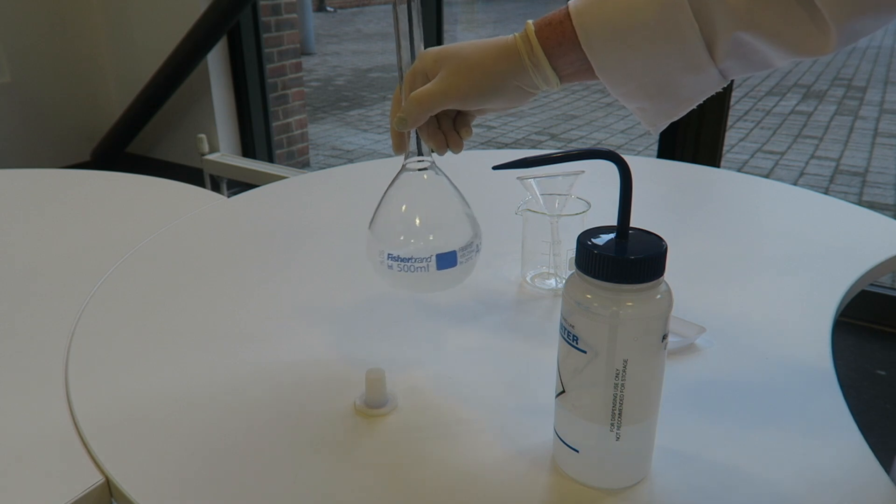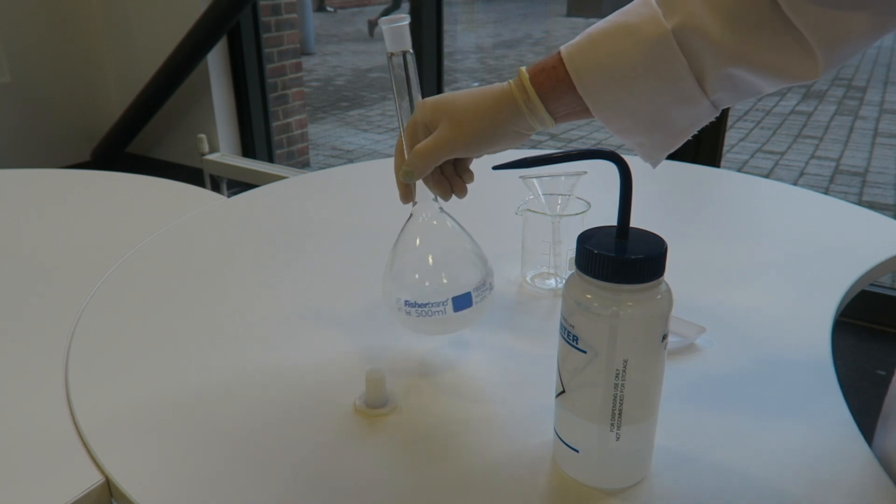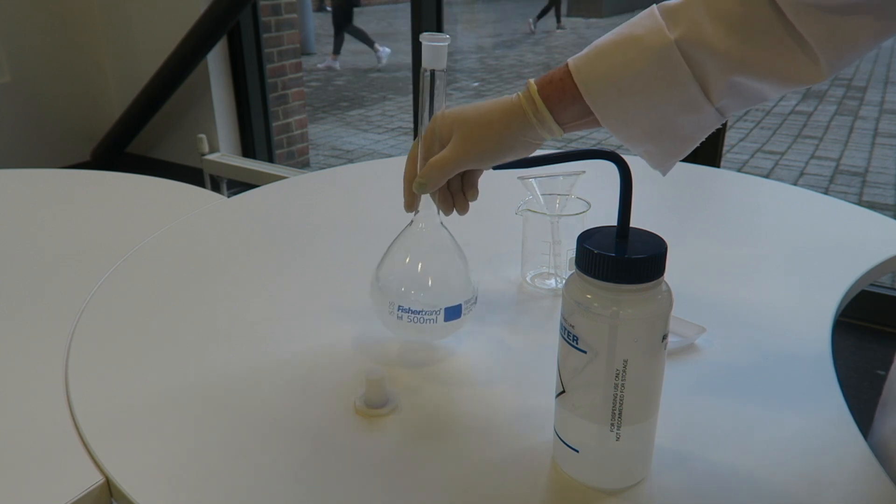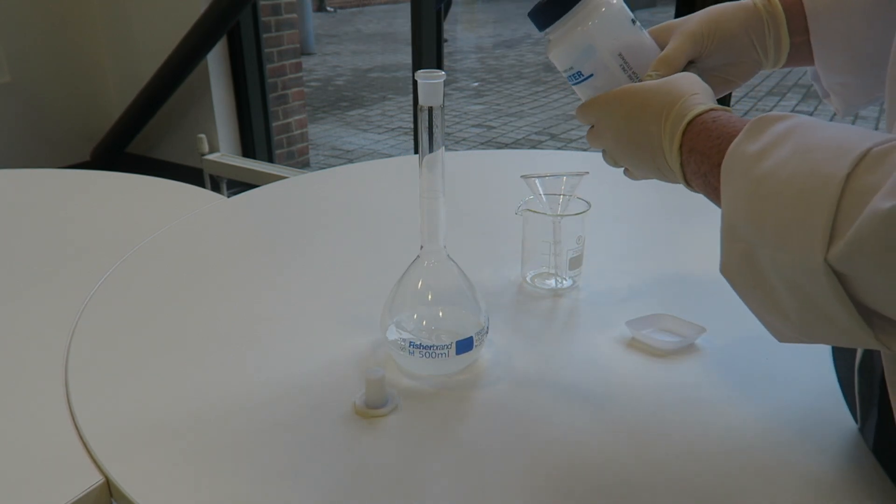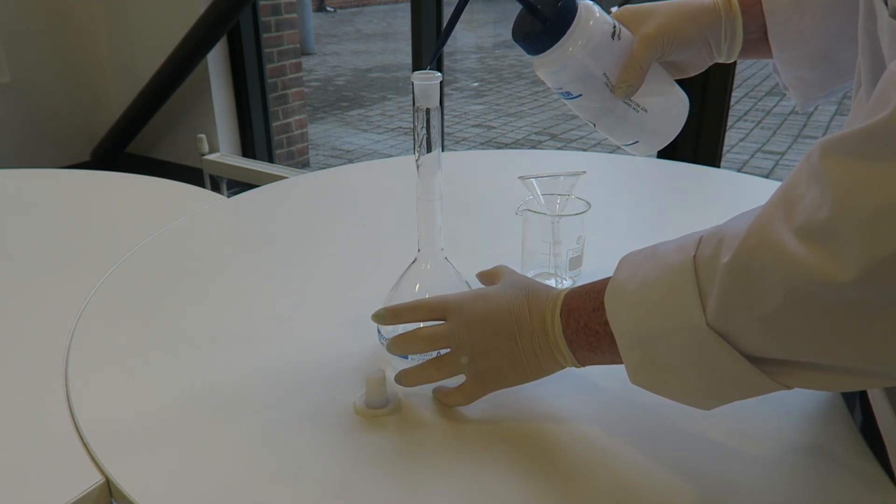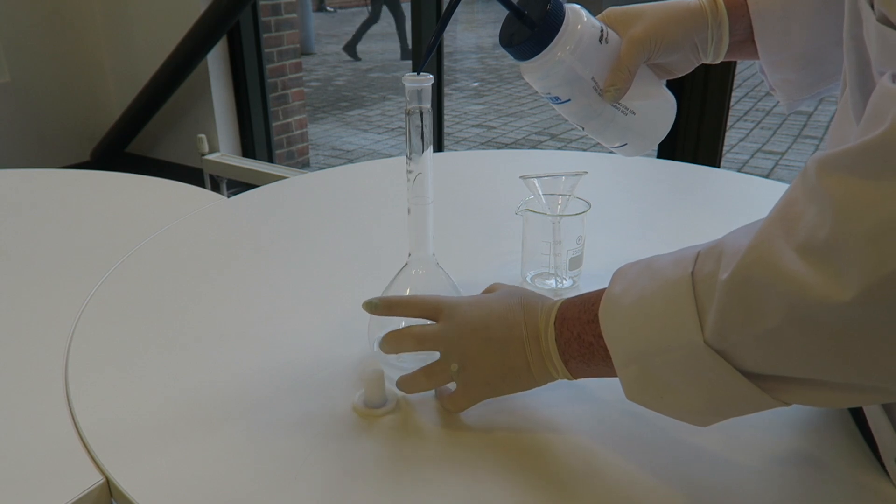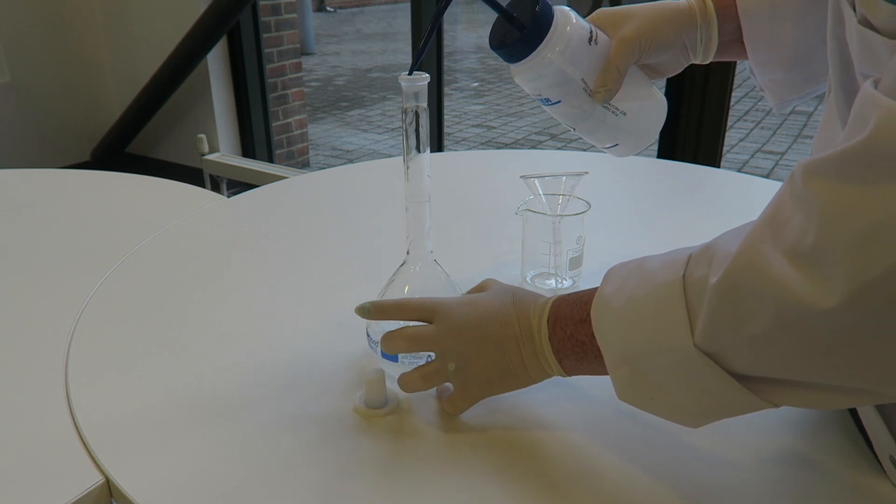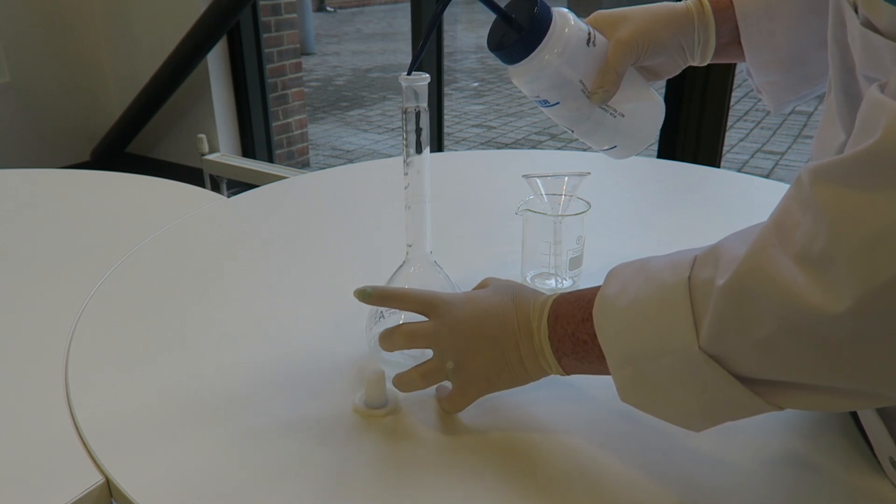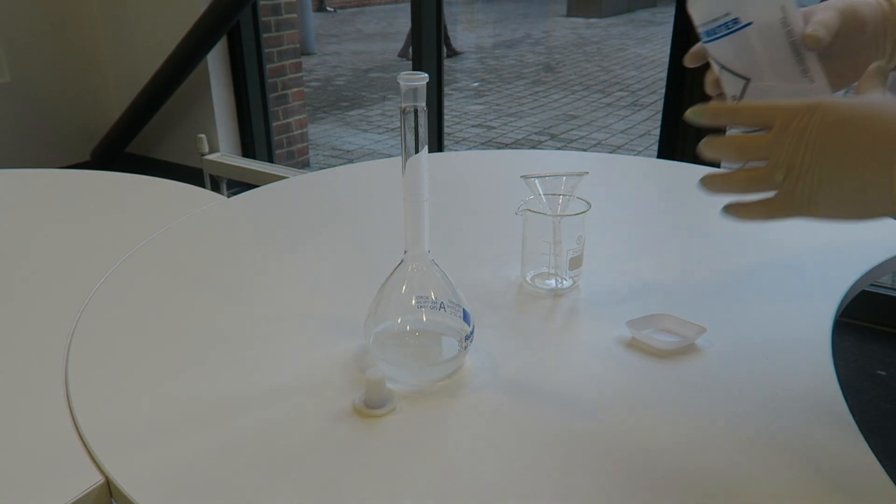We now need this to dissolve. So we can put more water in, just going around the neck of the volumetric to make sure any powder that is on the side there isn't missed.